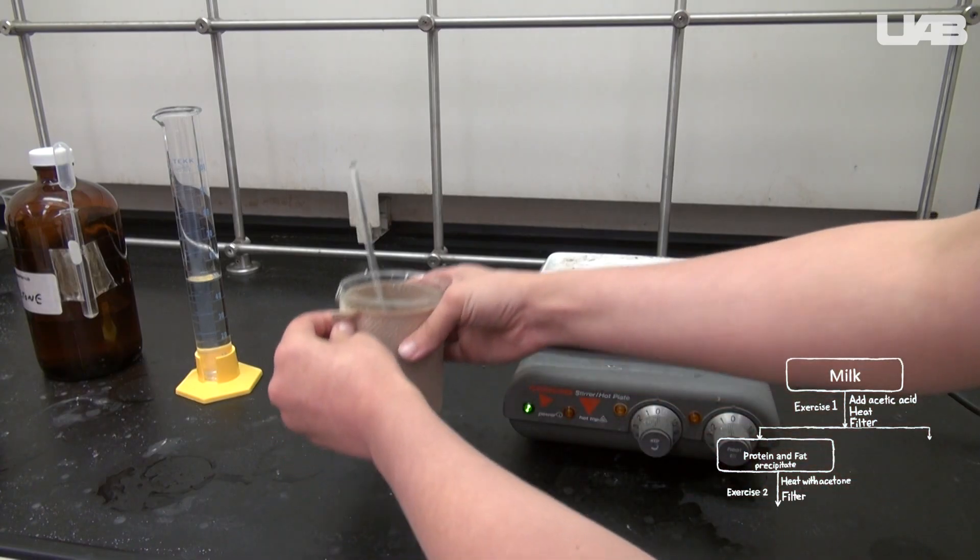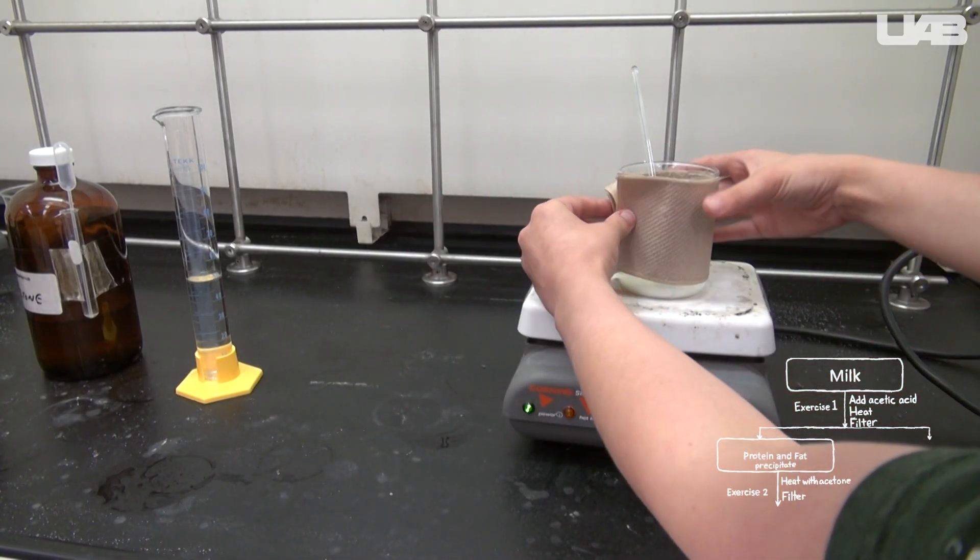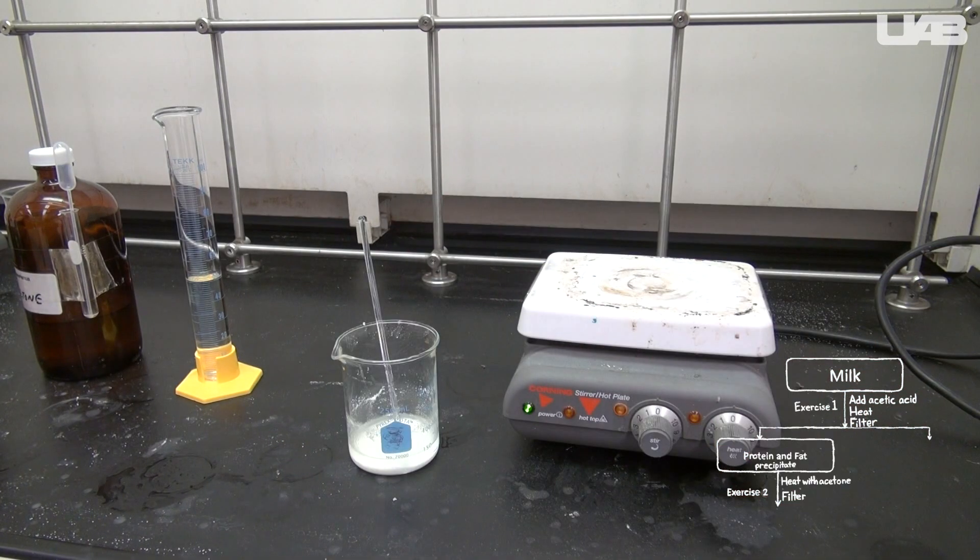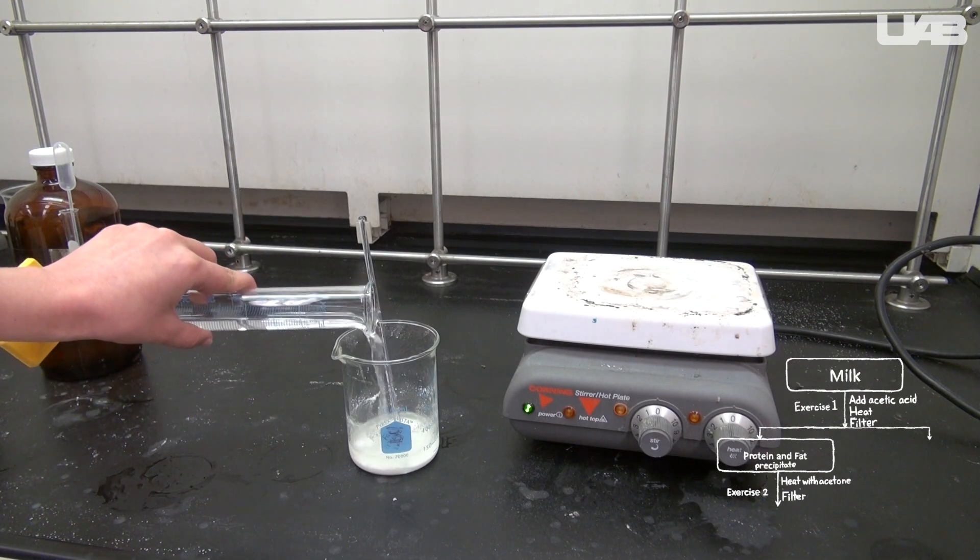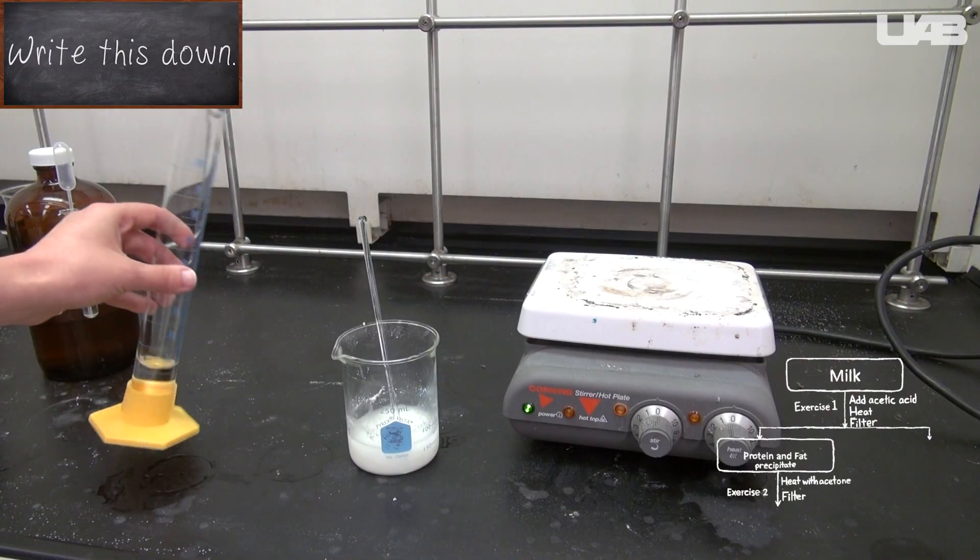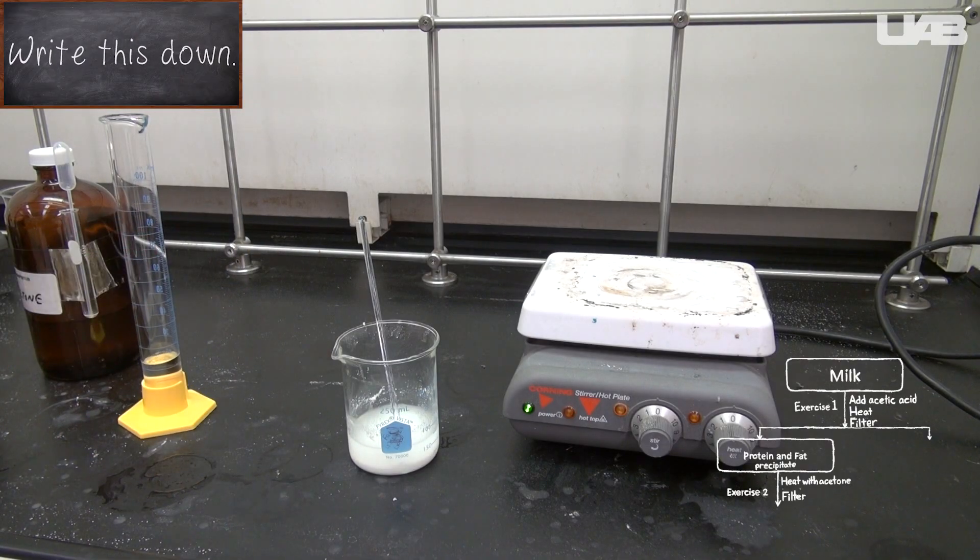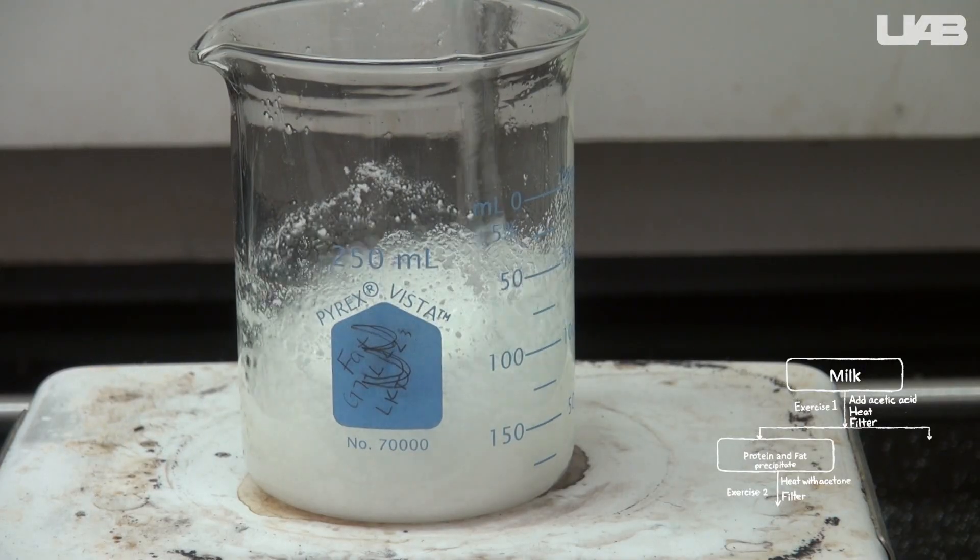Then put it back on the hot plate and let it come to a boil again. You should repeat this for a total of three cycles of boiling and cooling. Some of the acetone will evaporate while you do this, so periodically add more to keep it at its original volume. The fat should now be dissolved.